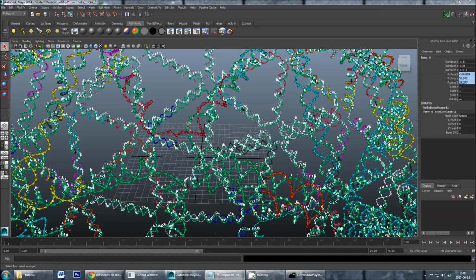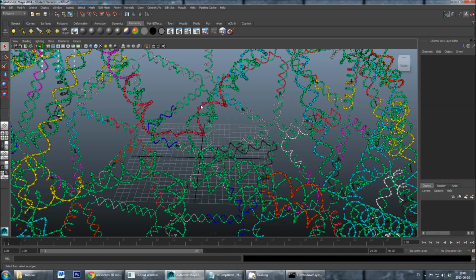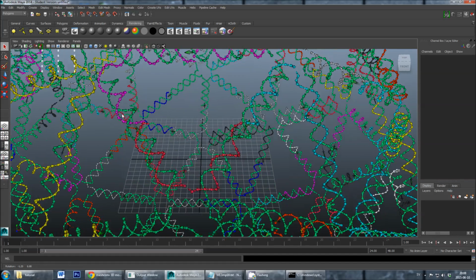Okay, now we have assigned a scaffold sequence. And if we again select the same piece of staple, we see that we now have the corresponding staple sequence assigned. And this should be true for all staples throughout the design.